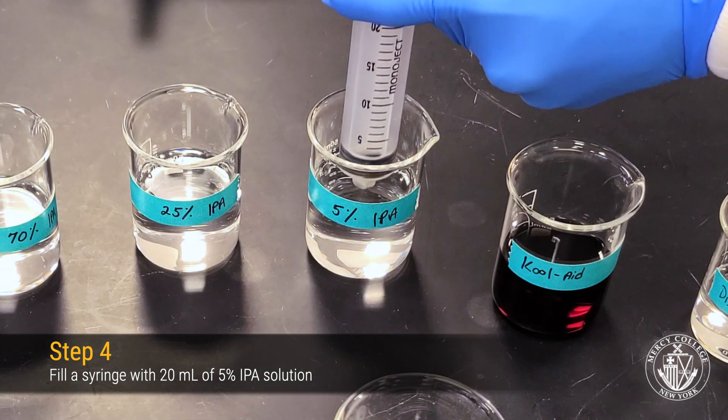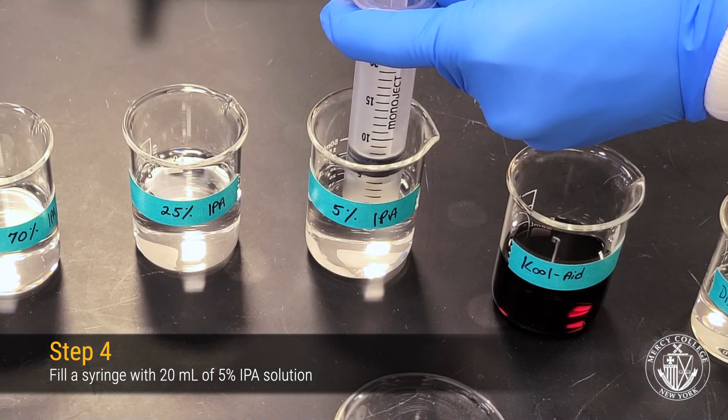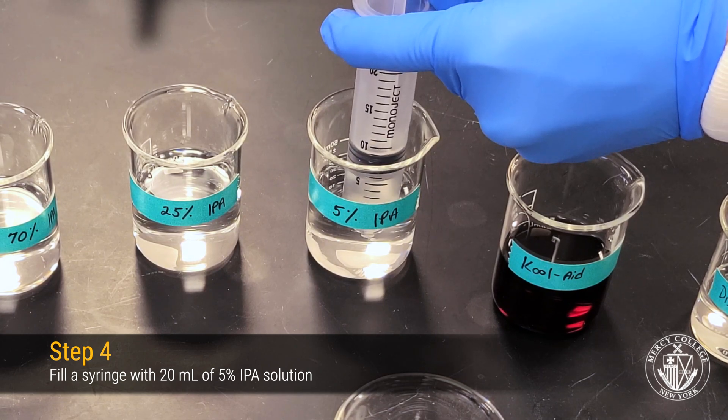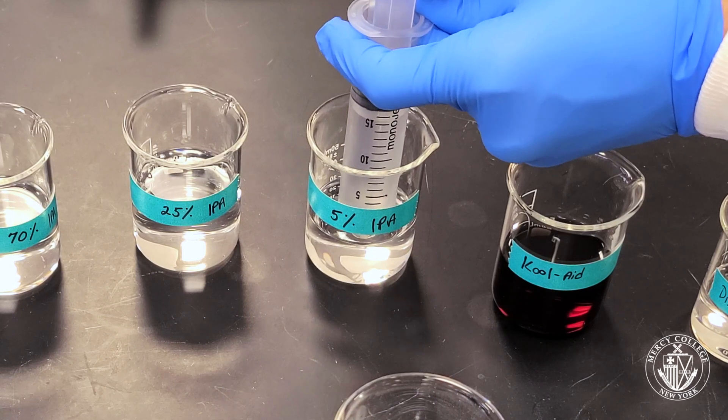In the next step, we're going to fill our syringe with 20 mL of 5% isopropyl alcohol. We're going to use the isopropyl alcohol in order to remove the red 40 color from the chromatography column.